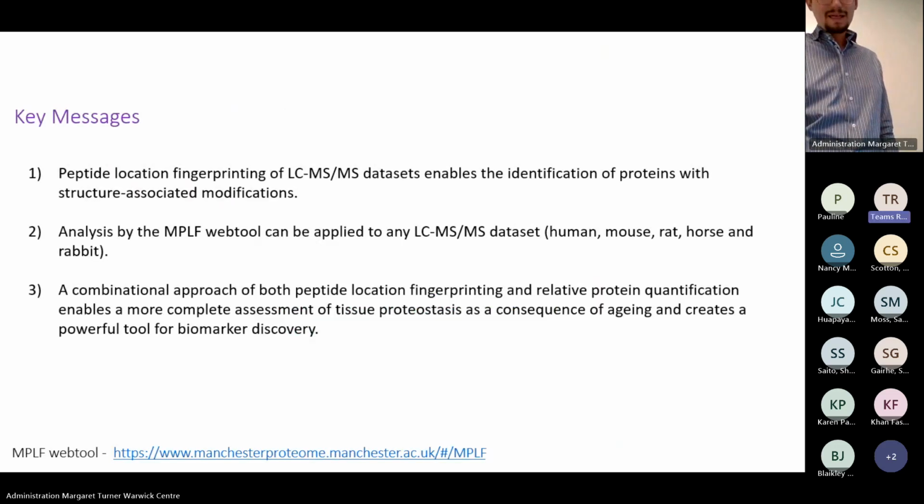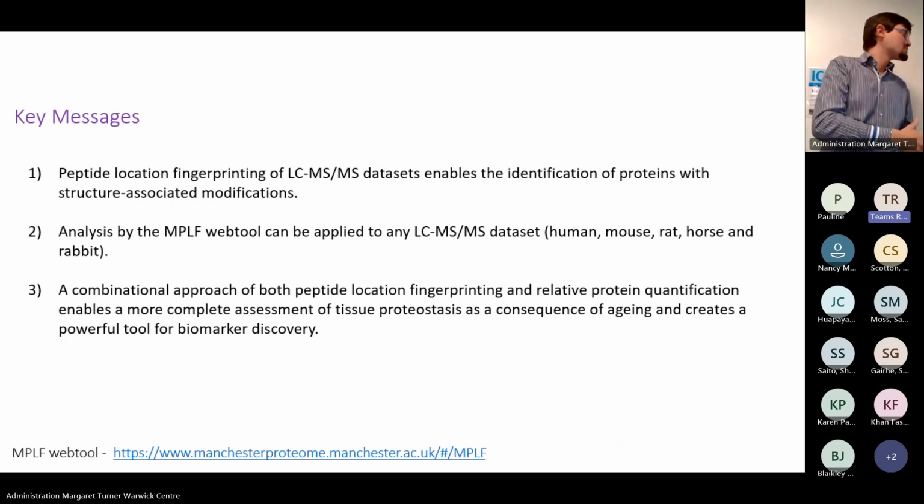So the key message for this talk is that peptide location fingerprinting, this tool that we use, is free to use. It's a web tool. I'm very happy for you to contact me if you've got any mass spec data or you want to go on any mass spec studies to look at changes in protein structure in the context of fragmentation, fibrosis, for example, or splice variation, whatever you want to have a look at, I'm very happy to collaborate on.